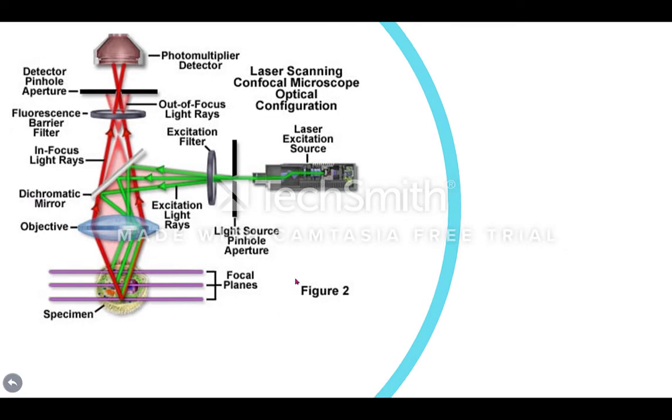Now we have the complete image of the confocal fluorescence microscope at work. You can see a bunch of light bouncing around the parts I just mentioned. Overall, the specimen will reflect the incoming light, which is then sent through the dichroic mirror and to the photomultiplier detector, where the complete image will gather.